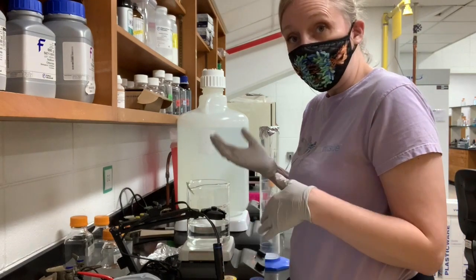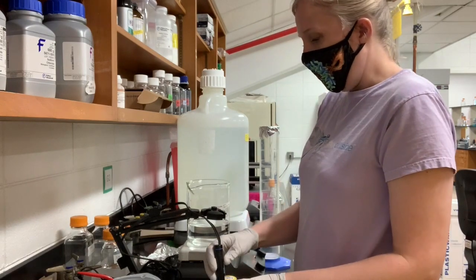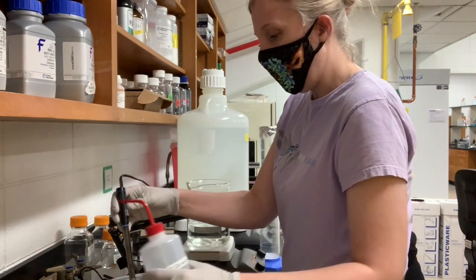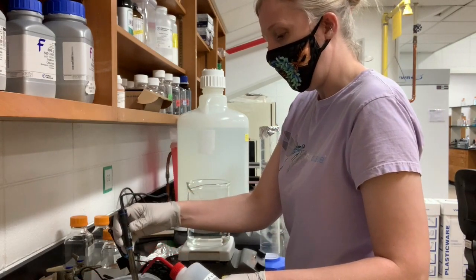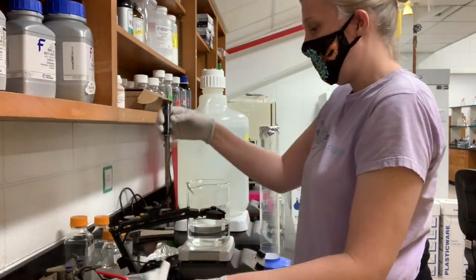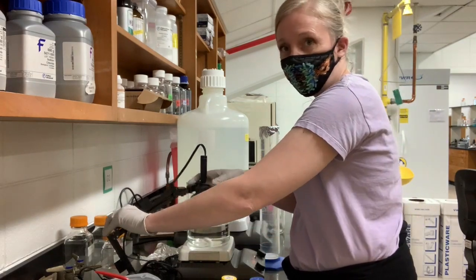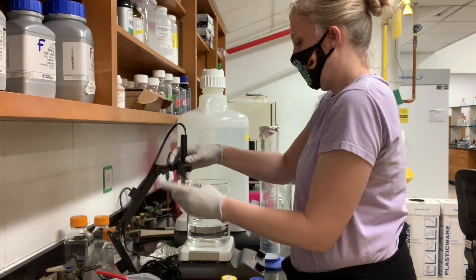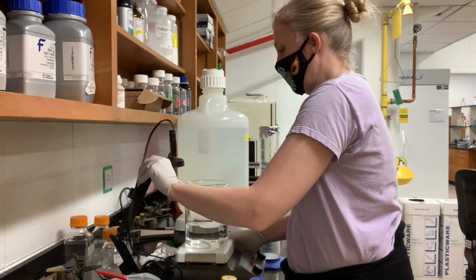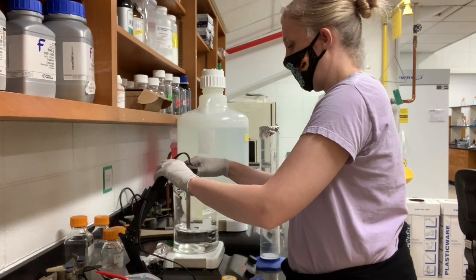Next, I want to go back to the measuring mode, and so I will hit F1, which says measure above it, and the meter will start measuring. So I'm going to rinse it off again since it's been in the pH 10 solution. I'm going to use the chem wipes again to wipe it down, and then I'm going to put this meter into the stand, which is kind of an arm for the pH meter. And I'm going to adjust both the arm and my stir plate so that the meter is in the solution that I'm pHing.